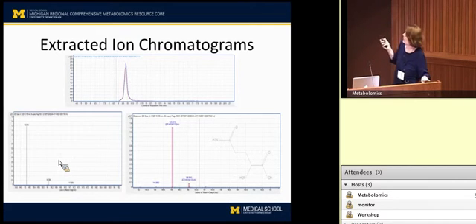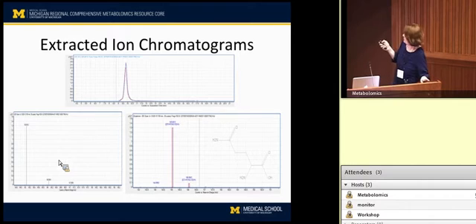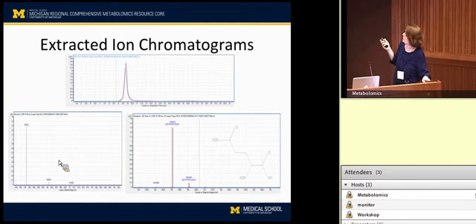One of the tools I wanted to show you, besides just looking at mass and retention time for a compound, is that these compounds have a signature of peaks associated with them. This here is the parent ion. It's actually M minus a proton, so it's M minus H. But there are other signature peaks that come out along the same time, and those are isotopes of the parent mass. Mainly the first one is the contribution of the naturally occurring 13C that's everywhere in our environment. So one of the interesting things about mass spectrometry is that, in addition to having that mass, you can look at this pattern and ask whether it matches what we expect. You could take the formula for this compound and predict what the isotope distribution should be, because that's a known entity.